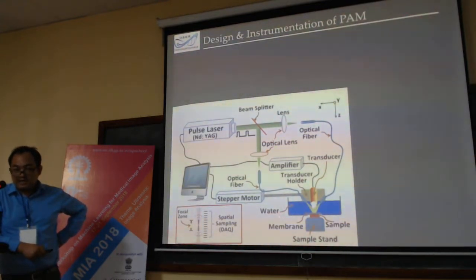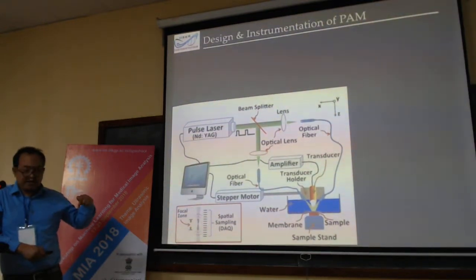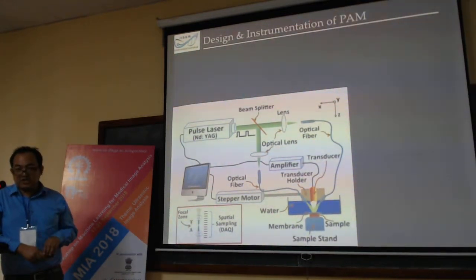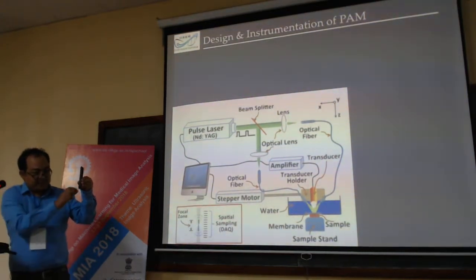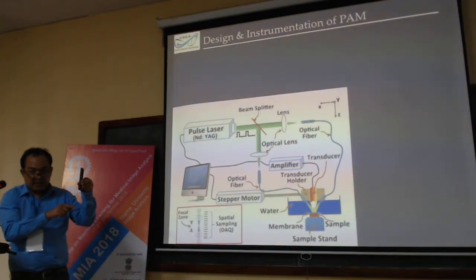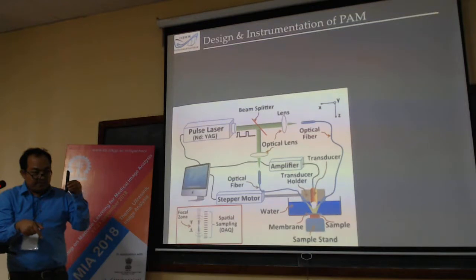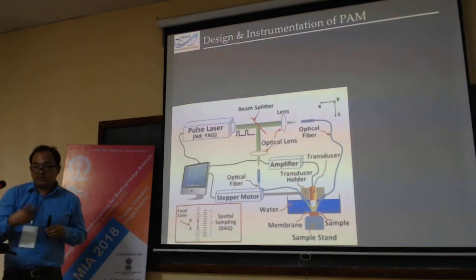1D data. If we move along a direction, then we will get 2D data. If we scan in 2D, then we achieve 3D data. So what I'm trying to say is that at one scanning position, with focusing over these regions, we discretize by the help of the data acquisition system. Then at one scanning position we have 1D data. If we move it, we get 2D data. If we move around, we acquire 3D data.